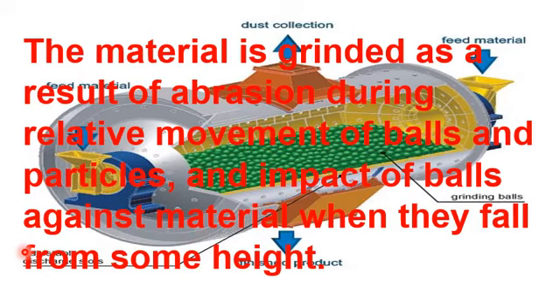So in simple words, student, in the ball milling apparatus, initially a bulk material is incorporated and there are grinding balls inside the ball mill apparatus.